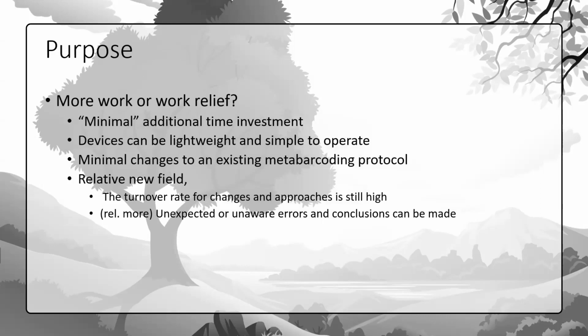Then for the final slides, I ask what the purpose is: is it actually a relief or does it mean more work? Compared to soil metabarcoding, it's actually quite similar. The minimal additional time investment is you just have to set it up, switch the filter, and that's basically it. The device itself is lightweight. It's this size, nothing more. It's simple to operate right now. It's just a switch on and off. Maybe in the future I will implement it so that you can determine the time, how long it should run.